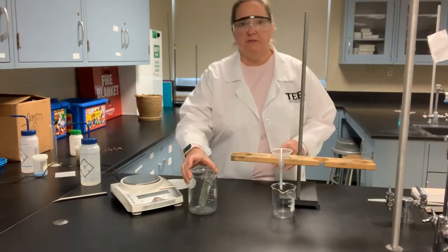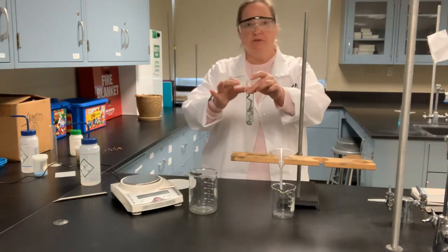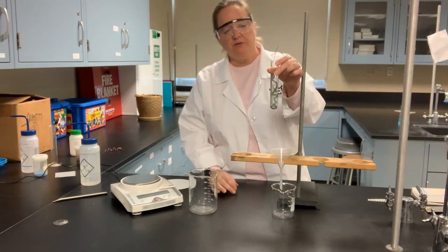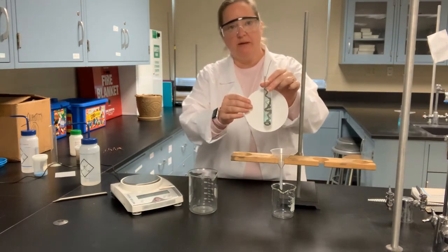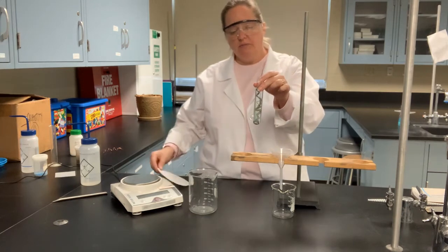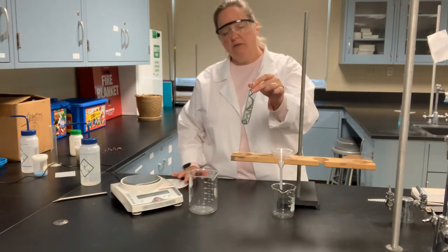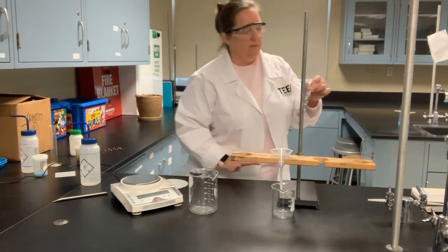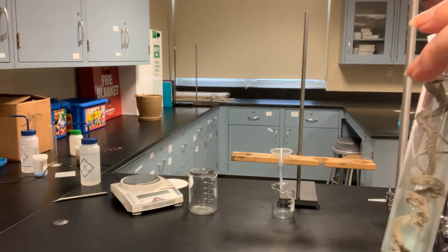Okay students, so it has been a full 24 hours and you can see our test tube here, and the final picture showed that the solution, and if I put the white background behind it, you can see the solution is definitely no longer completely clear. It has a bluish tint to it. You can also see a pretty good view of the silver crystals that have formed. And I'm actually going to come a little bit closer so you'll be able to see those even better as I remove the copper coil.